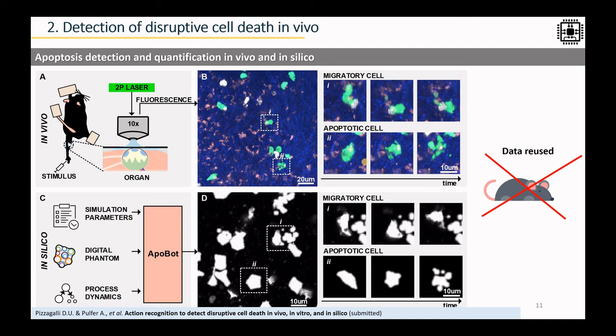I want to stress the fact that for this project we did not perform any single experiment on animals, but we reused videos acquired by others in which we opportunistically found cells undergoing disruptive cell death.